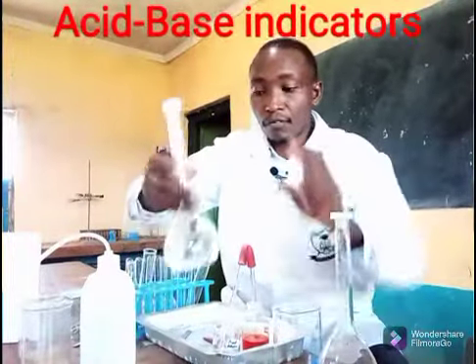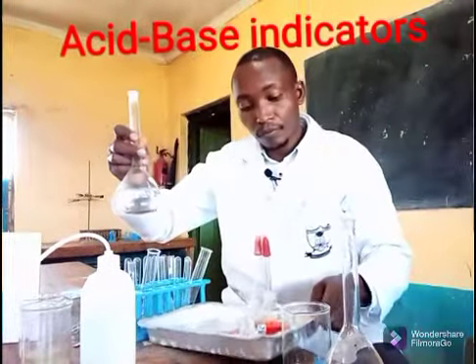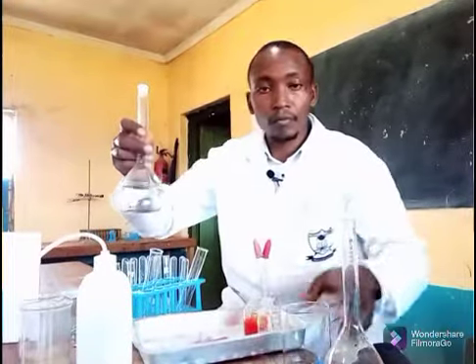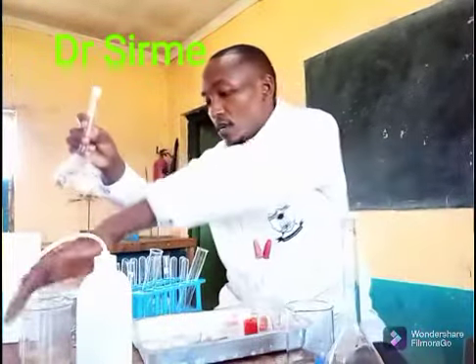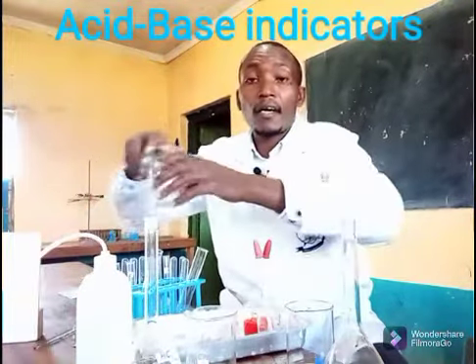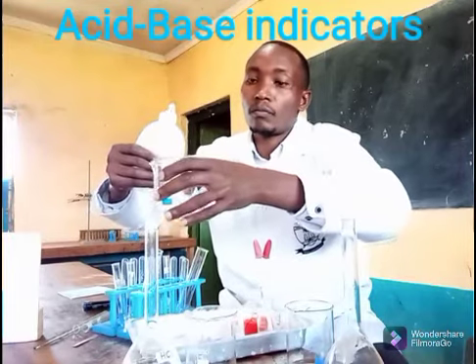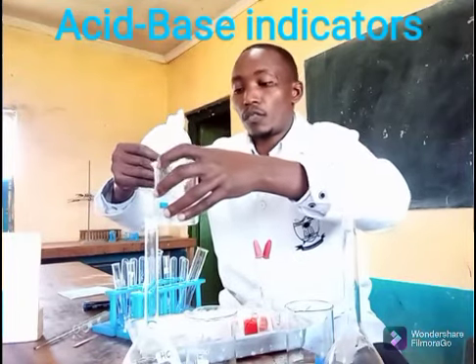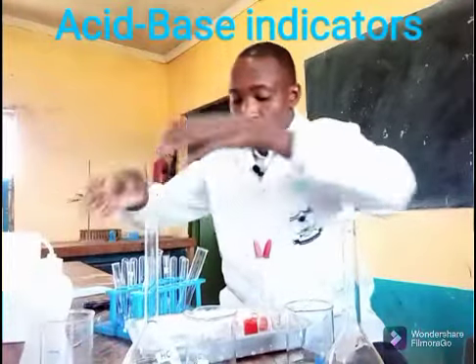I'm going to have hydrochloric acid in the beaker. Then finally, I'll have some distilled water in another beaker.